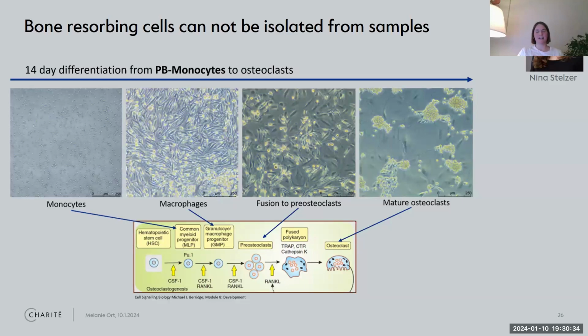And the thing is that you have to differentiate those cells directly on bone, on the bone scaffold, because once those cells have fused, you cannot get them off anything. Nina, with another colleague, has been trying to scrape those cells off a tissue plate, and according to her, it was quite a ride. So you do have to differentiate osteoclasts on bone directly.